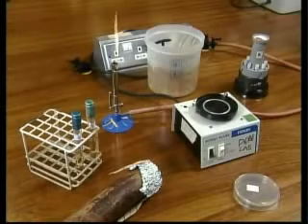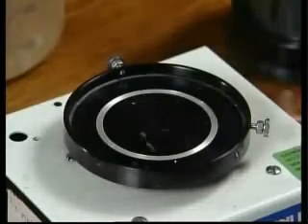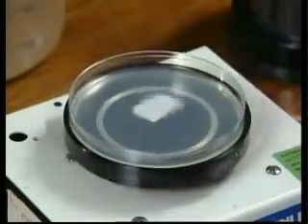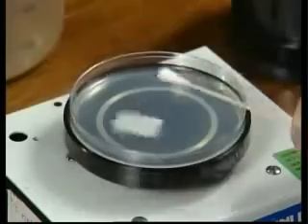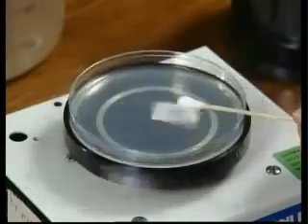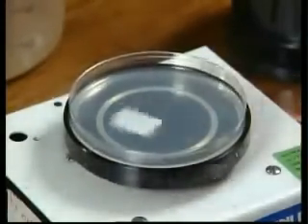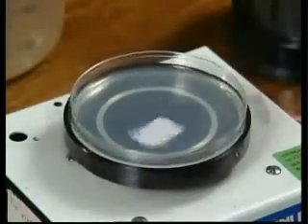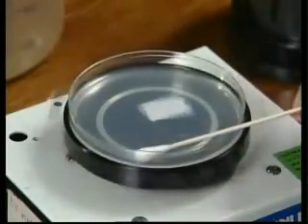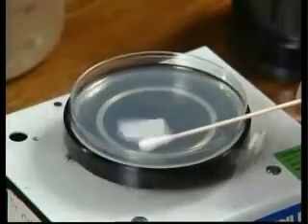In laboratories where large numbers of sensitivity tests are performed, a rotary plater may be used. The uninoculated plate is placed on a turntable and is rotated. The control strain is inoculated in the centre of the plate. The swab is dragged from the centre of the plate to the silver ring, visible on the turntable. The test strain is then inoculated on the remainder of the plate, moving the swab from the outer edge of the plate towards the silver ring.